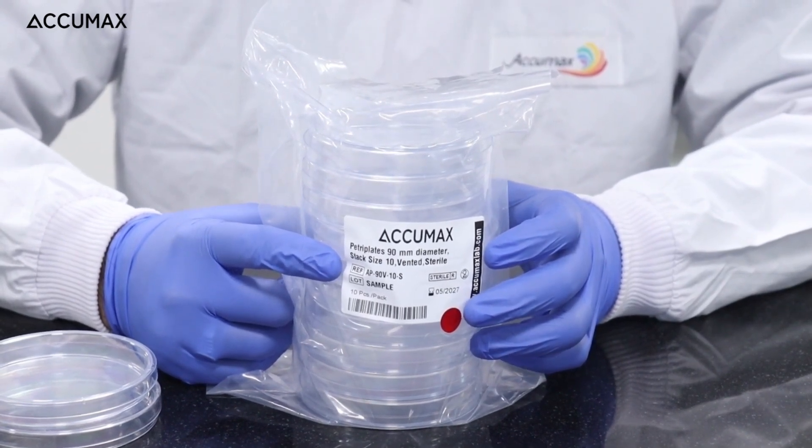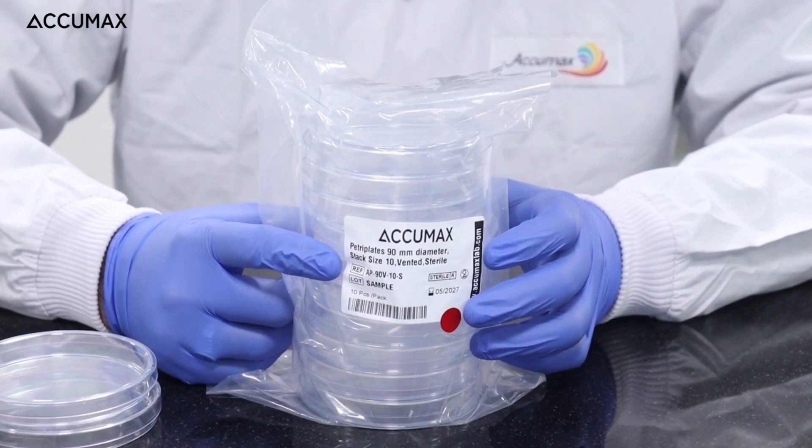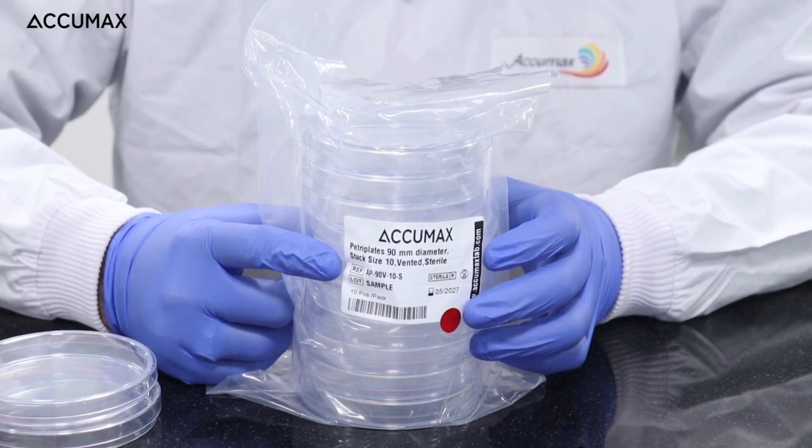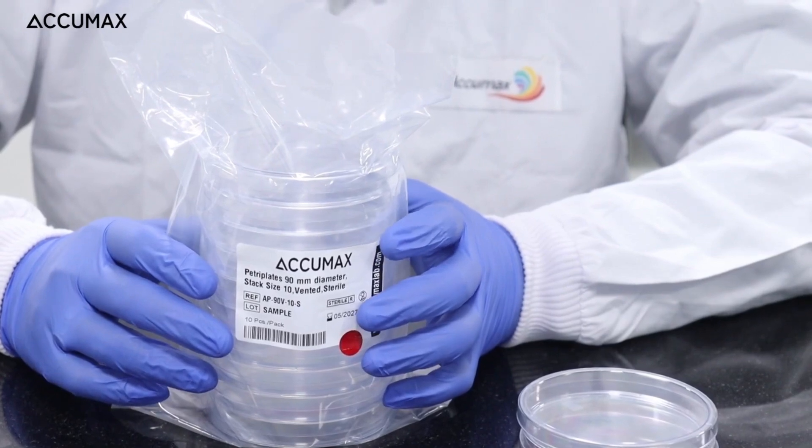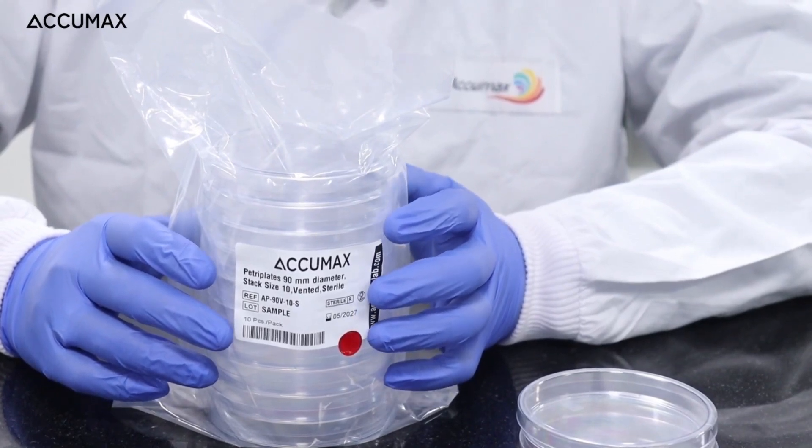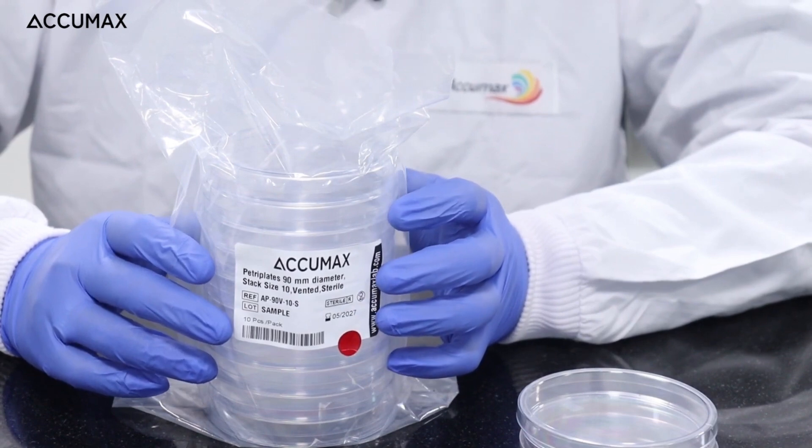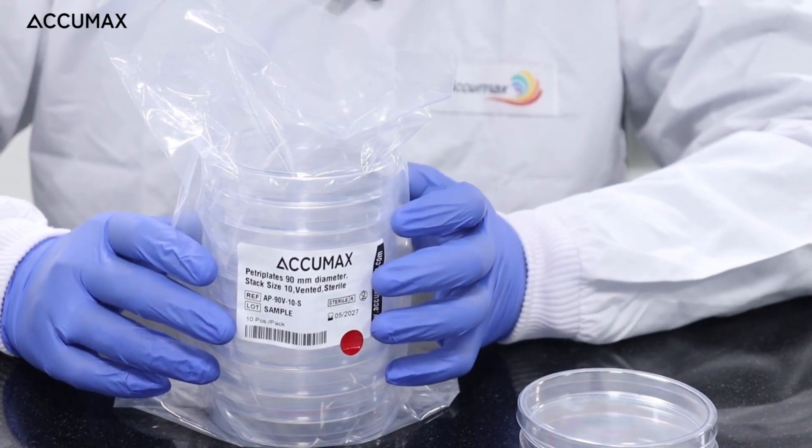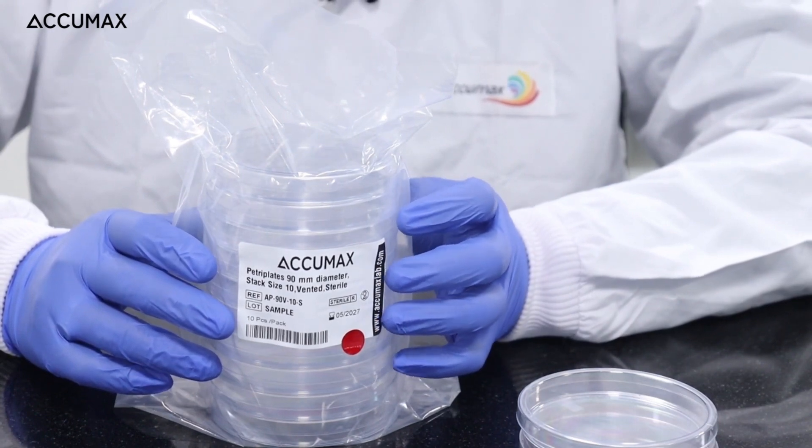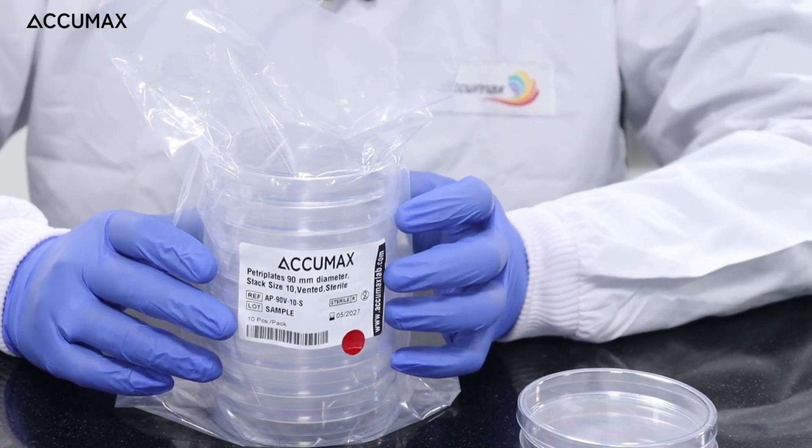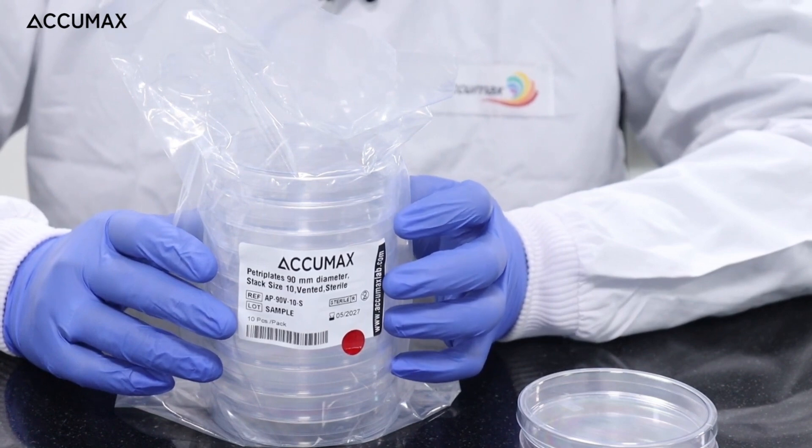As you can see, the sterility assurance level is the crucial point when you are using these petri plates for pharmaceutical applications. Sterility assurance level of Accumax petri plates that are sterile is 10 to the minus 6. That indicates there's a chance of only one organism out of one million organisms surviving the sterilization process.